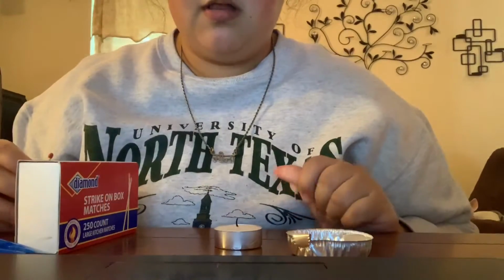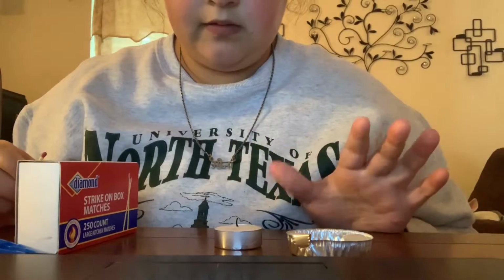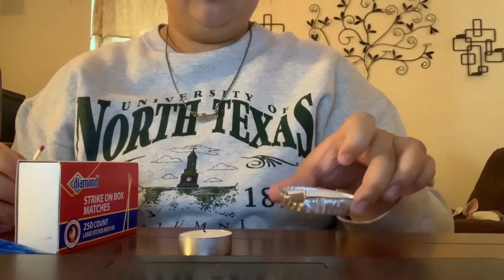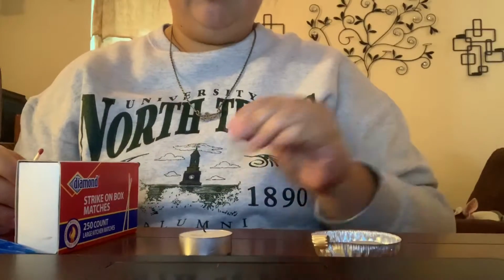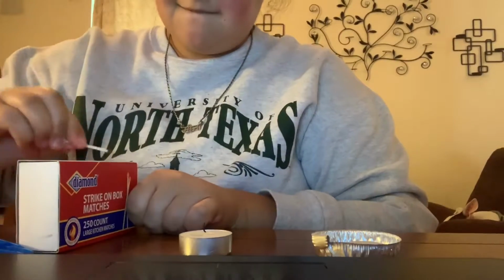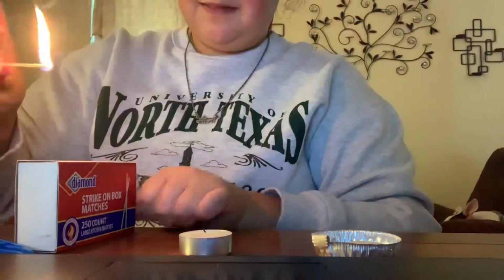After recording all of the other required descriptions from the candle being lit, I will now relight the candle and hold this nice chunky ice cube, my ice cube, smoothing around over the flame, and I guess we'll find out what happens, as if we don't already know. Every time.